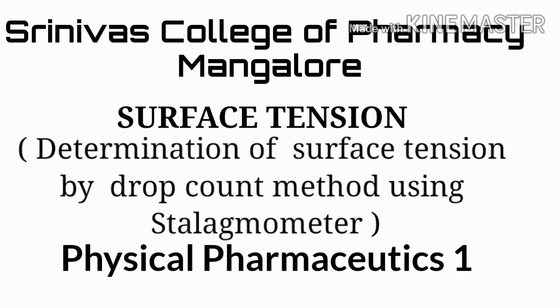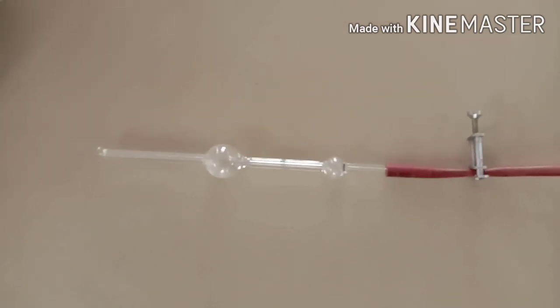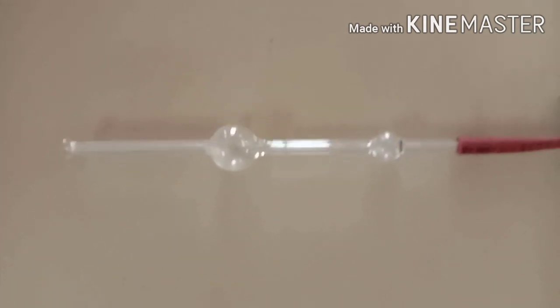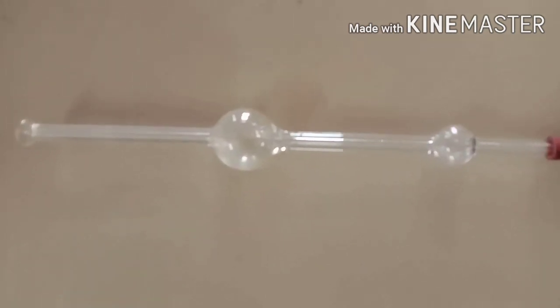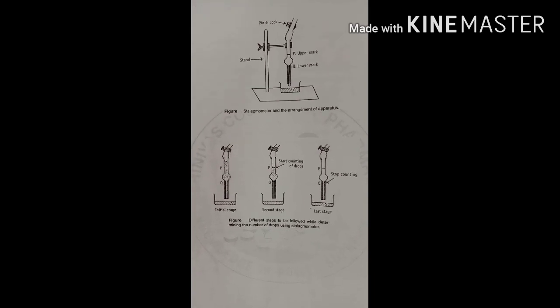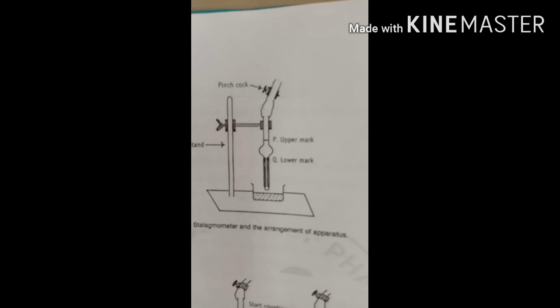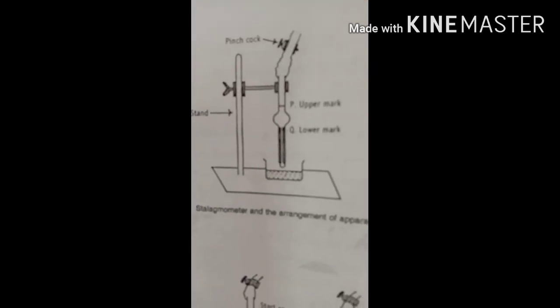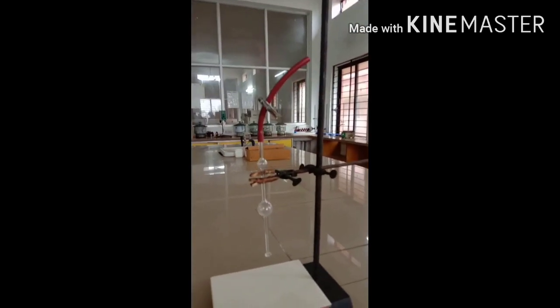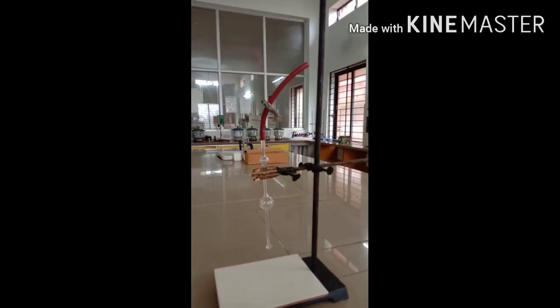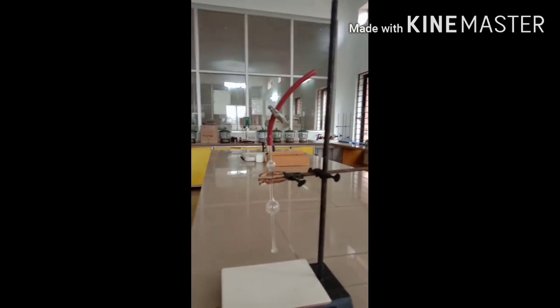This is the stalagmometer. We have to take a clean and dry stalagmometer, attach it vertically to a stand. It has, you can see, upper mark and lower mark. So attach it vertically to a stand and tighten.